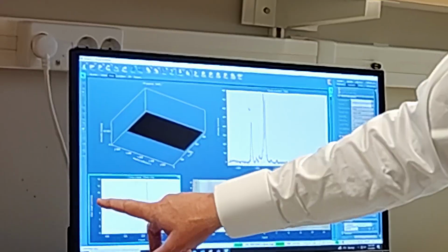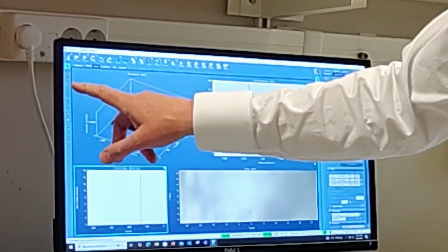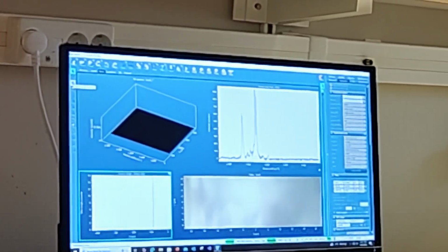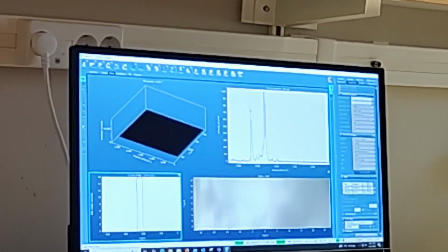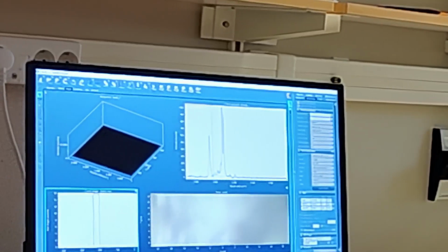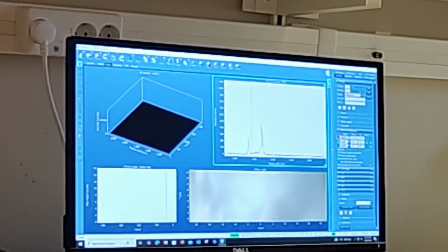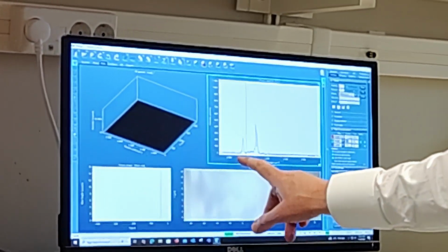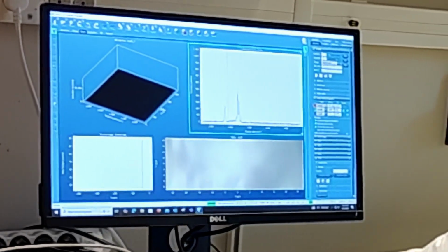But then, okay, what intensity is this? Well, it says green here, so we have 3 cursors: the red, the green, and the blue. So if I take this one, here, the second one was the red, apparently. Under Analysis here we can see that we can reset these positions. So let's put the green one on this. It's from 2,900 to 3,000, perhaps.